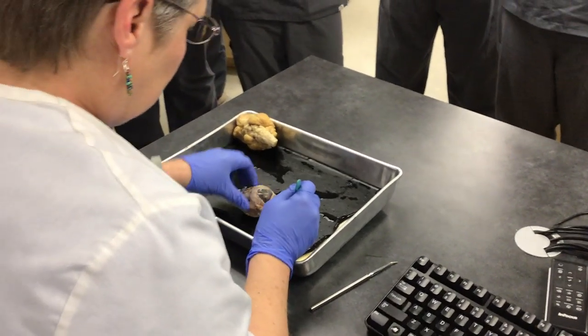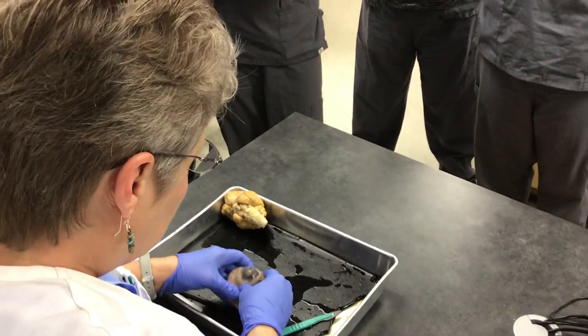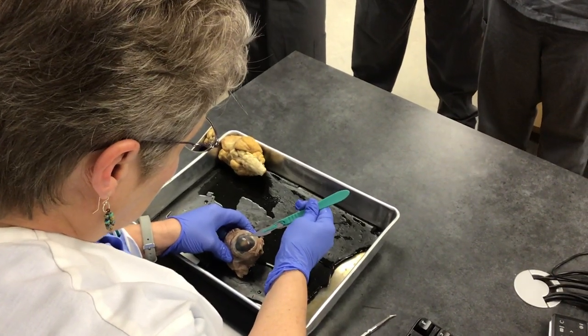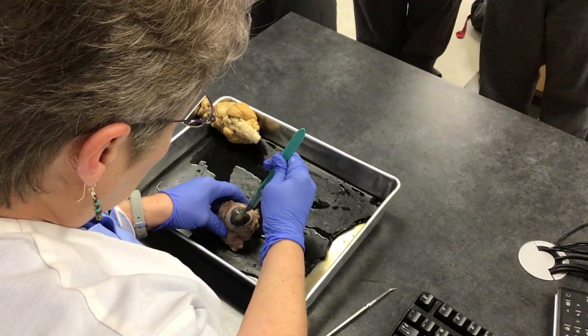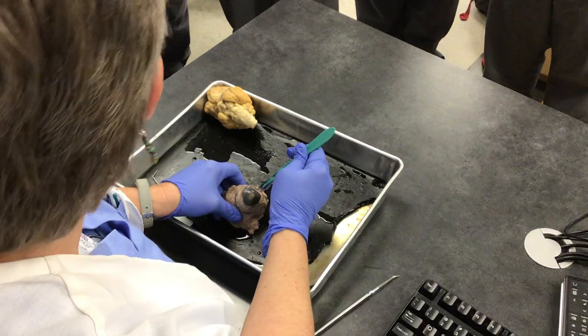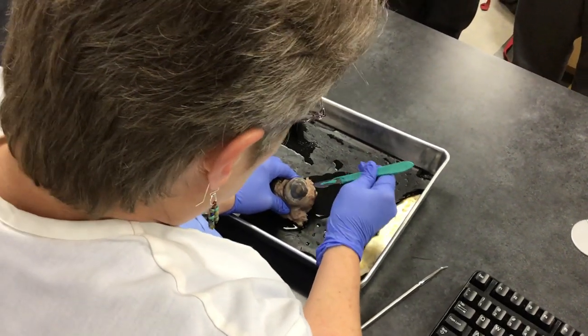So the first thing we're going to do is make an incision right here, right in the sclera. The sclera is that white, tough material. And a lot of liquid will come from it, as you can see, swerving out.